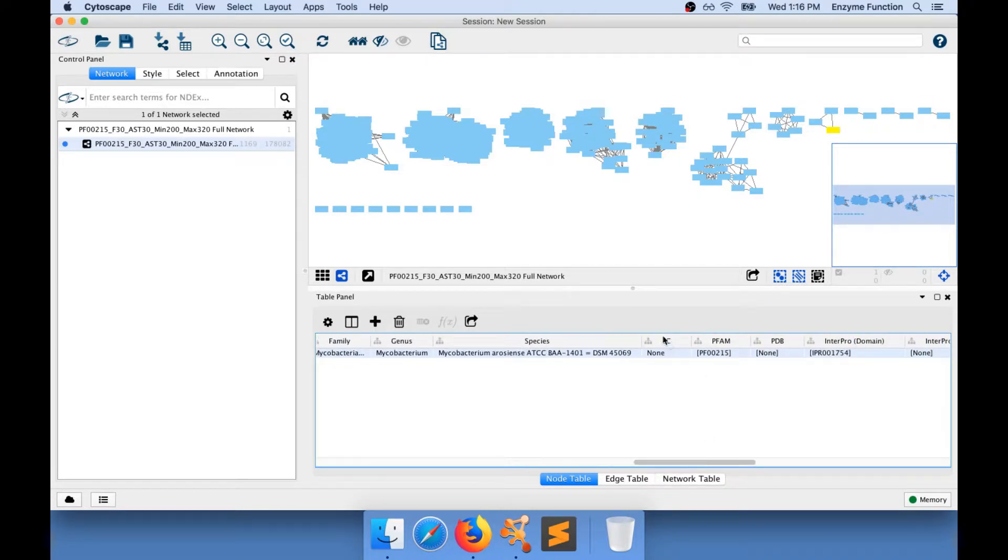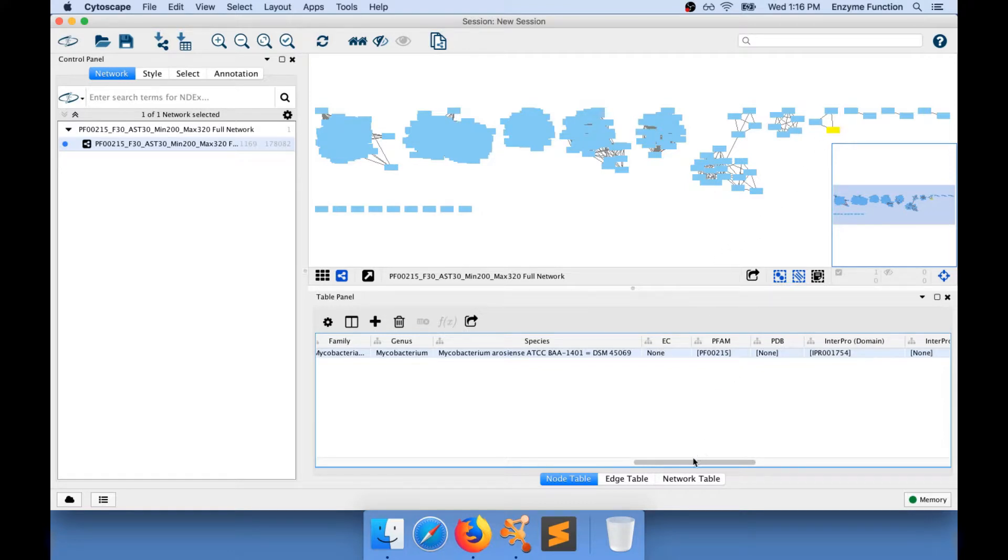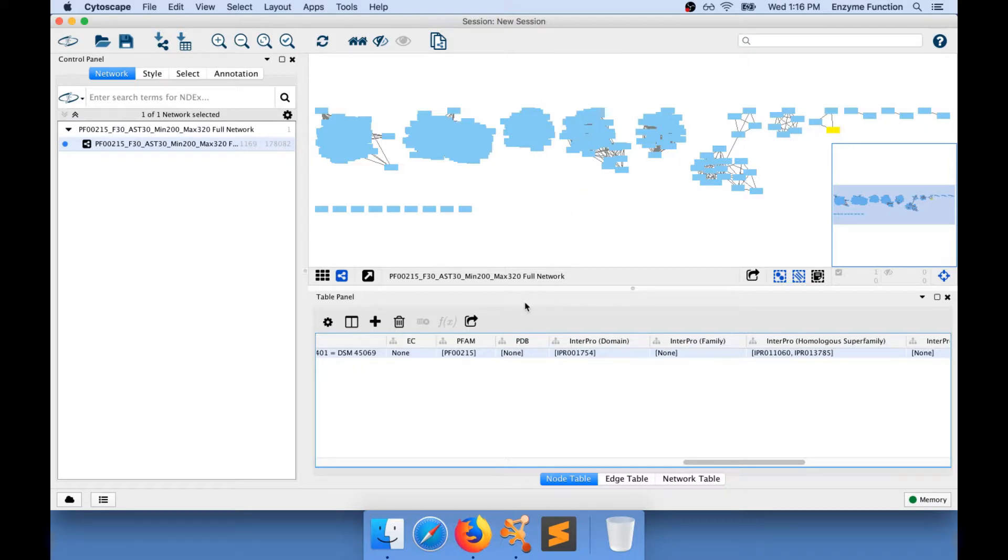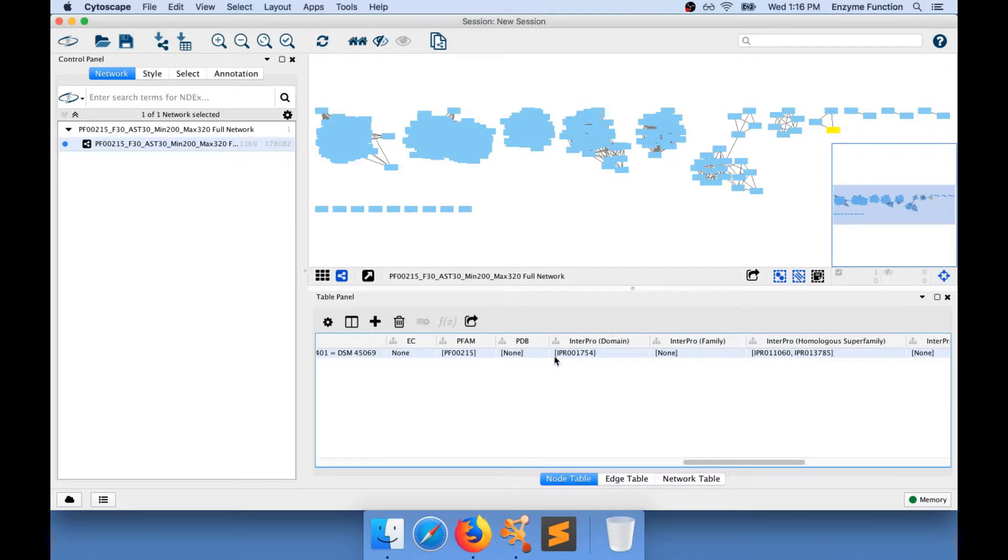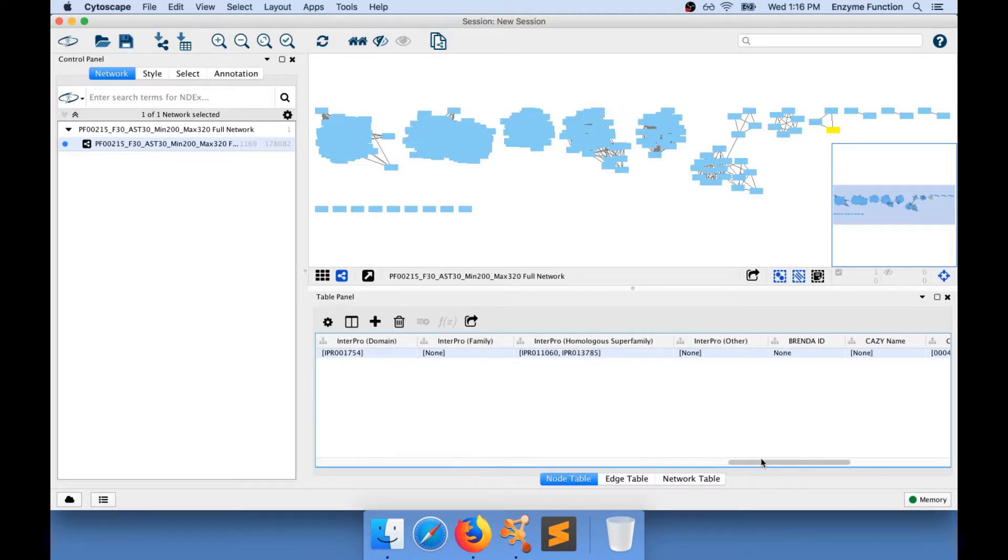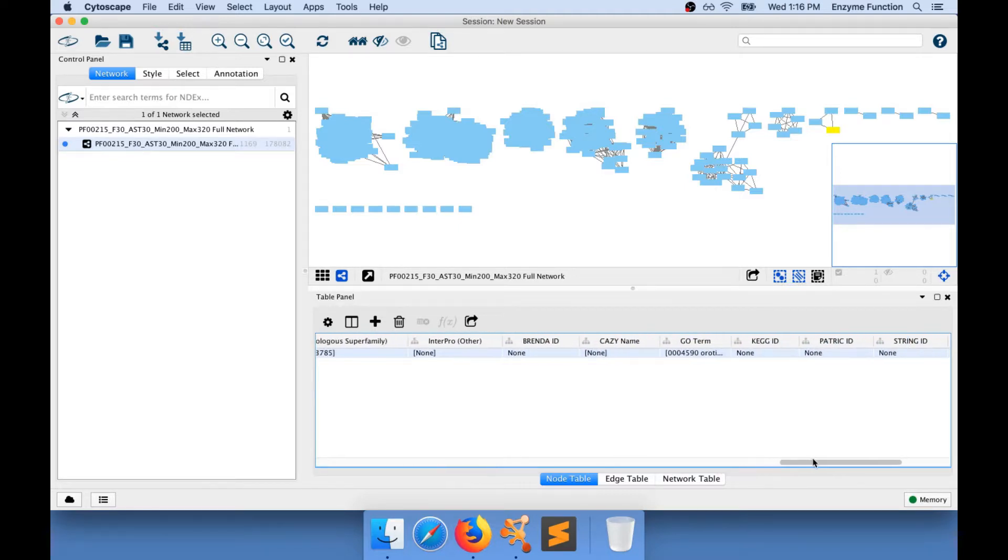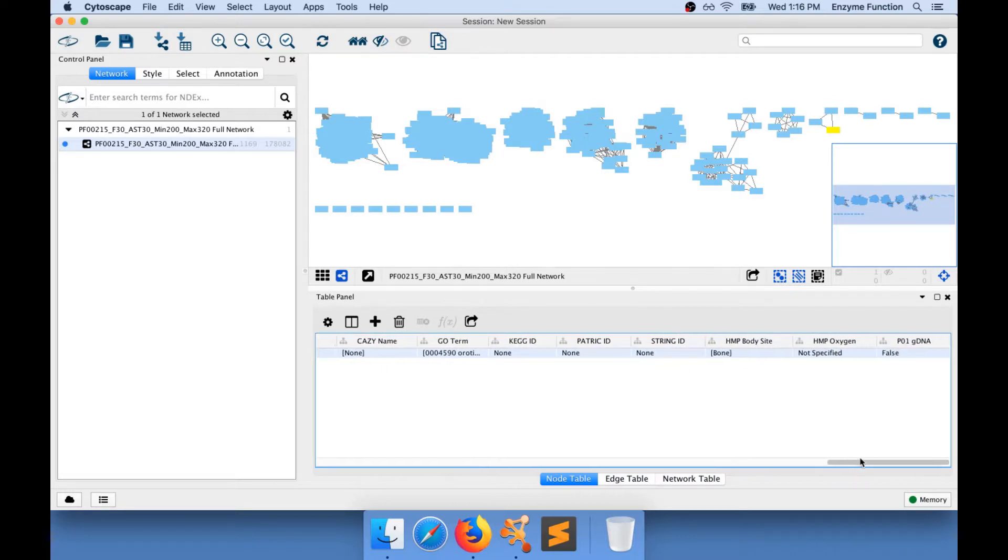There is currently no EC number associated with this node in UniProt, but this sequence has been matching the PFAM family PF00215, and also the InterPro domain family IPR001754. We can see more information on the right.